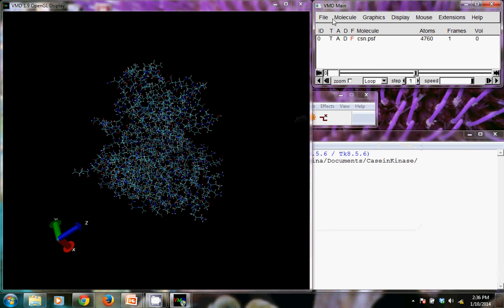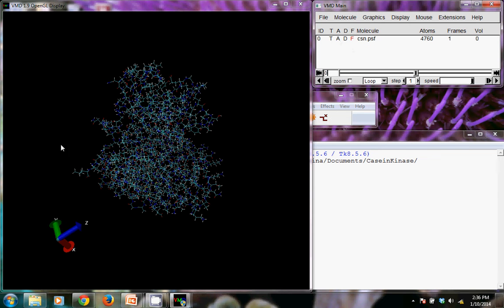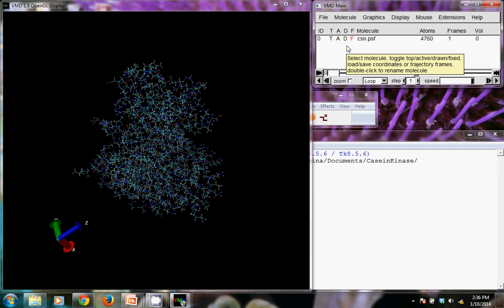You'll also notice that in the main window it only loaded one thing. That PDB file is actually held within the PSF file in a sense. So they're associated with one another.